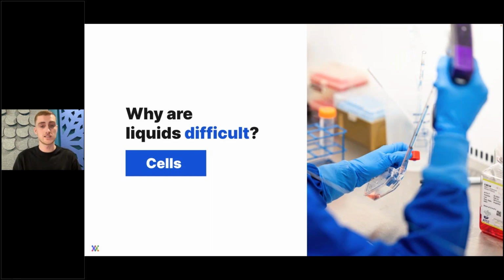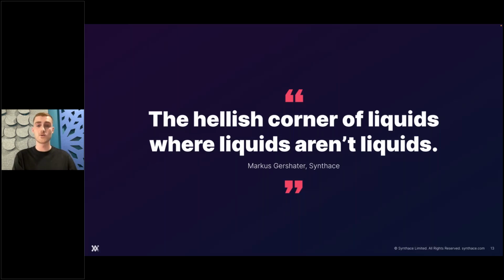And of course, some liquids can be even more difficult, and we can't treat all liquids the same, and we need to handle each liquid differently. Think about pipetting oils and DMSO and maybe even genomic DNA and particulate samples. And some liquids just really don't play ball. So liquid handling can get very difficult very quickly. And honestly, at times, I've started to even question whether my liquids are liquids, which brings us on to another quote, and this time from the Synthace co-founder himself, Marcus. "We enter the hellish corner of liquids where liquids aren't liquids."